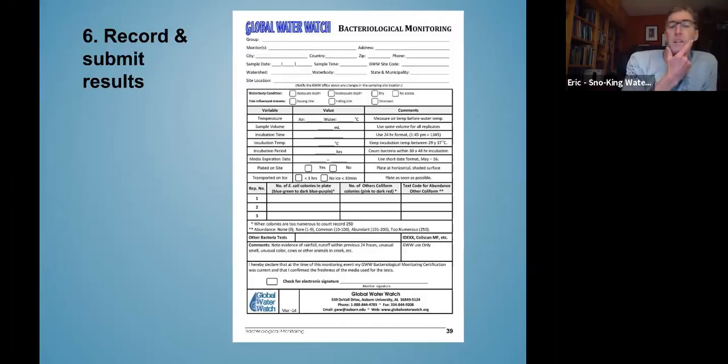The media does expire, so we always check before we monitor to make sure it hasn't expired, and we record the expiration date on the form. Plate it on site. We generally don't plate it on site, and you may or may not transport on ice. And then there's a place to record the E. coli and the other coliform.